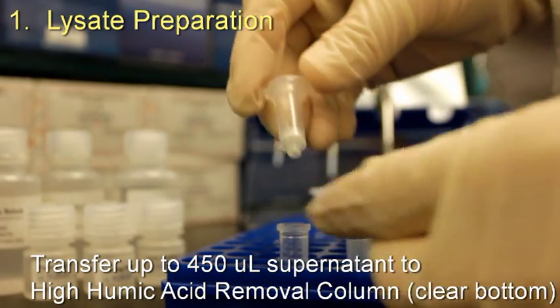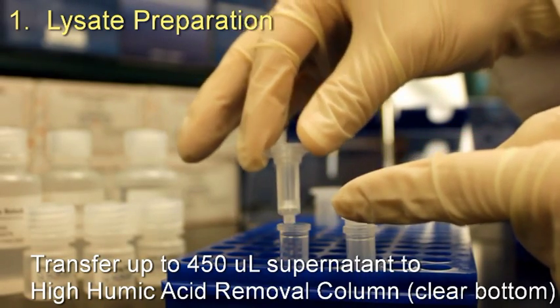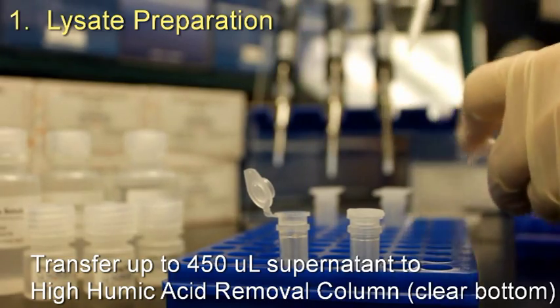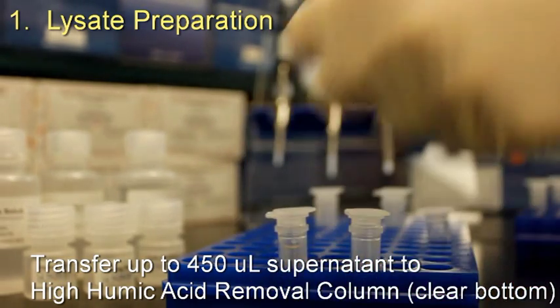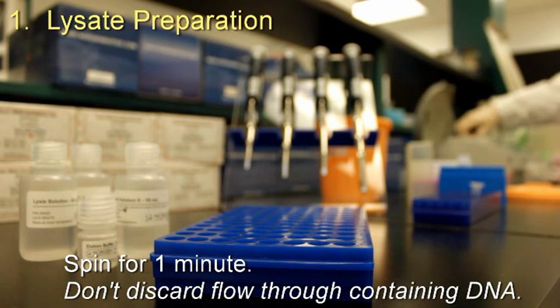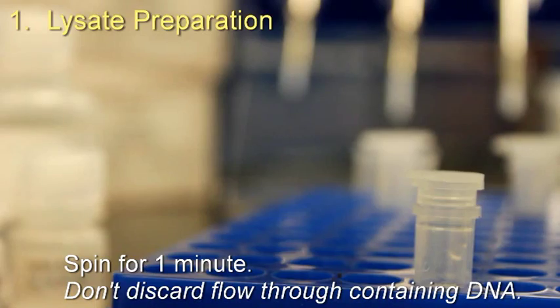Transfer up to 450 microliters to a clear bottom, high humic acid removal column. Spin for 1 minute and be careful not to discard the flow-through containing DNA.